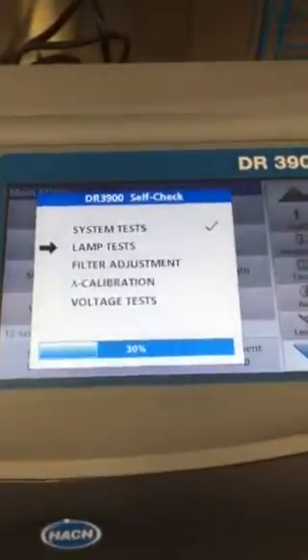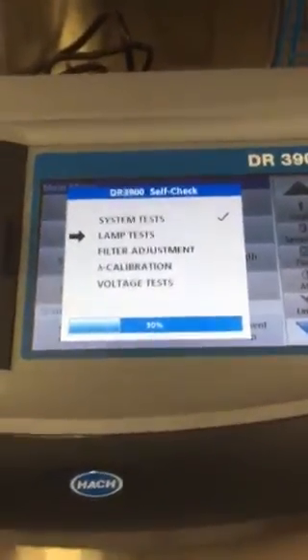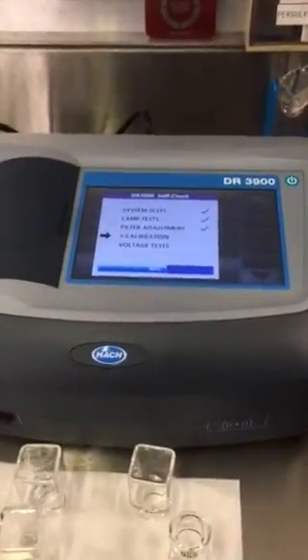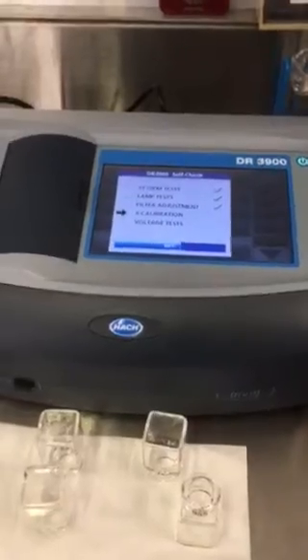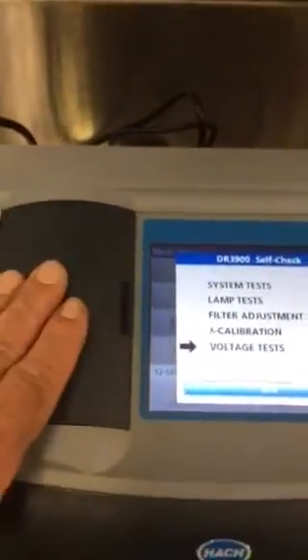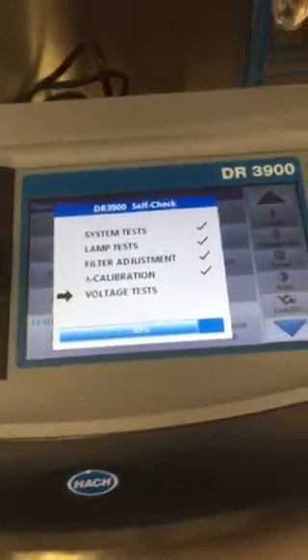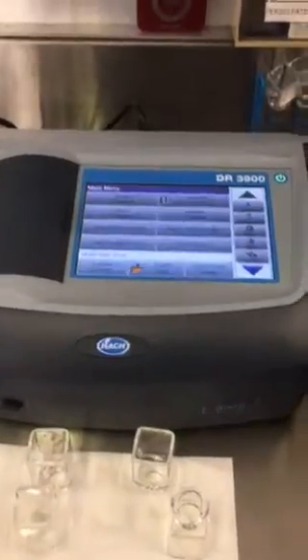We just turned on the new 3900 and it's going through a system check, just like the 2800 did. Something important to remember with our lab equipment, especially the spectrophotometer — it's a very expensive piece of equipment. When it's not being used, keep the door closed to keep the light cell inside from getting dirty and dusty, because that will change your test results.